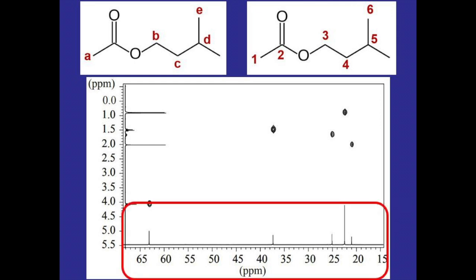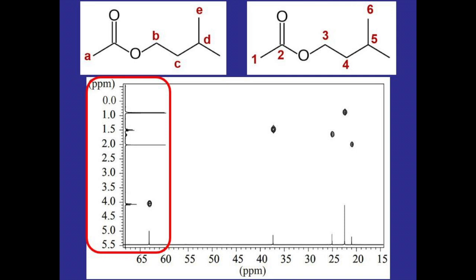On the x-axis you can see the remaining peaks of the carbon NMR, and on the y-axis you can see the H-NMR, which we've already labeled, so I'm going to go ahead and include the letters for those.